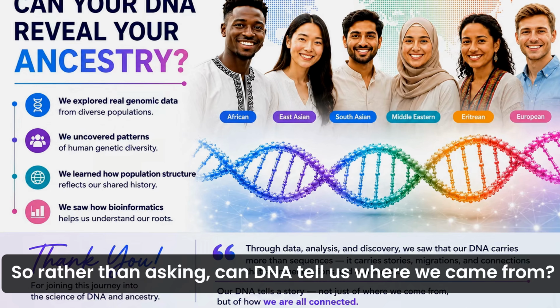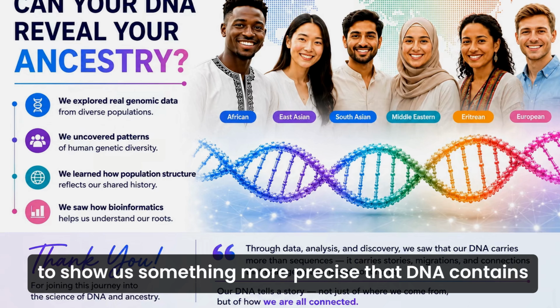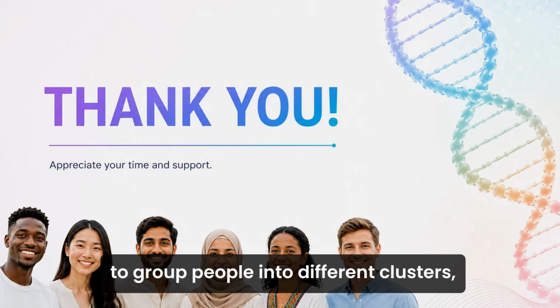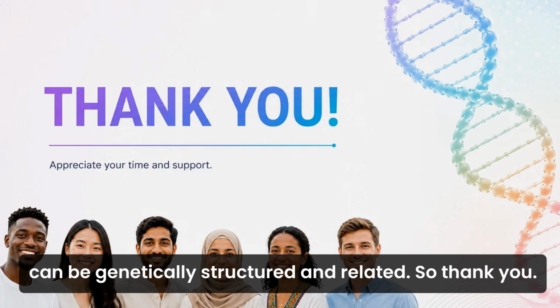So rather than asking, can DNA tell us where we came from, our analysis has shifted to show us something more precise: that DNA contains patterns of variation that allow us to group people into different clusters and to investigate how human populations can be genetically structured and related.